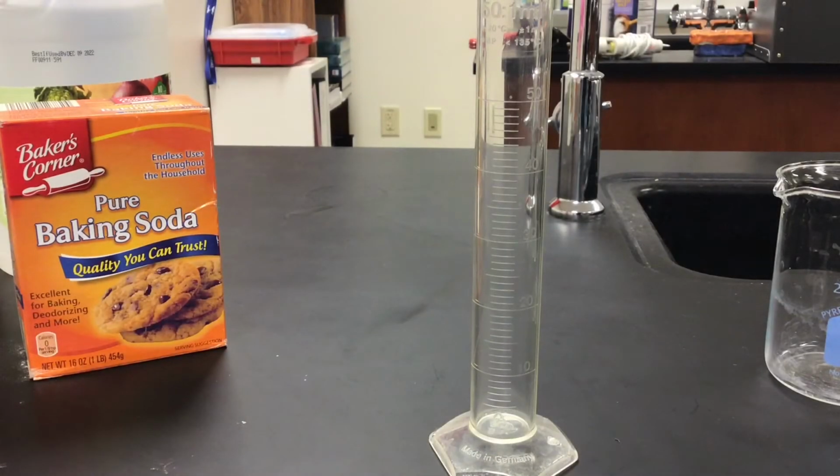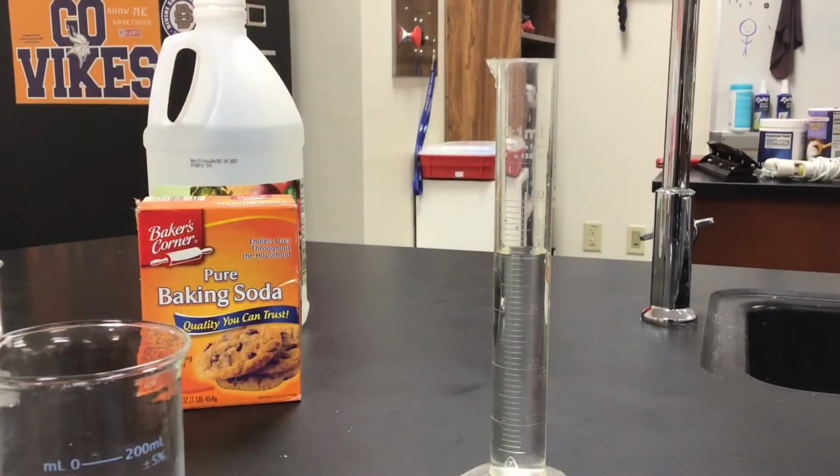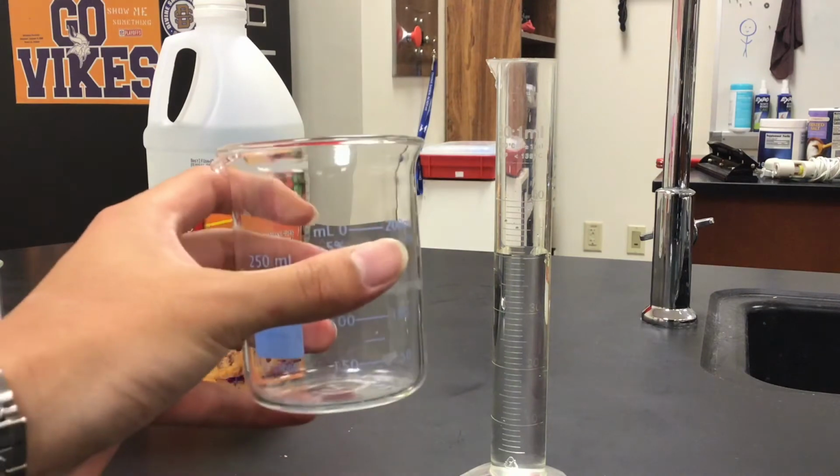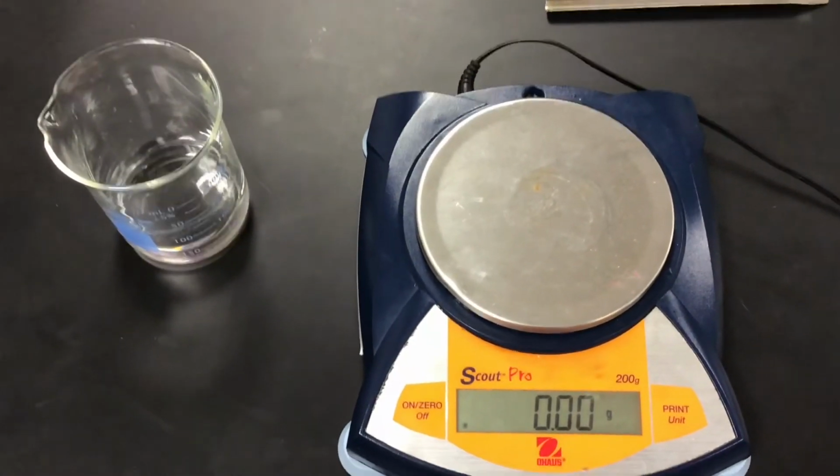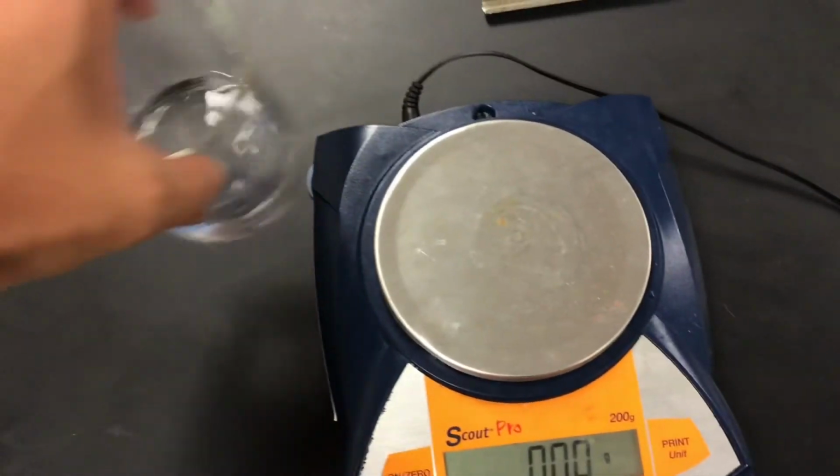First, I'm going to use the 50 milliliter graduated cylinder to measure a total of 60 milliliters of vinegar. Since I only have a 50 milliliter graduated cylinder, I decided to measure 40 milliliters first, then measure another 20 milliliters, then pour it all into the beaker. I'm going to place the beaker, which already has 60 milliliters of vinegar in it, on the balance.